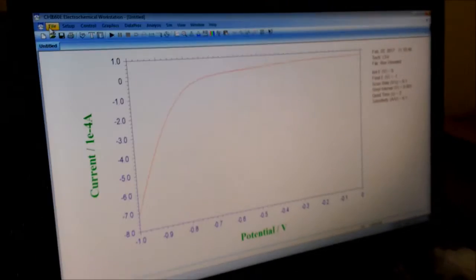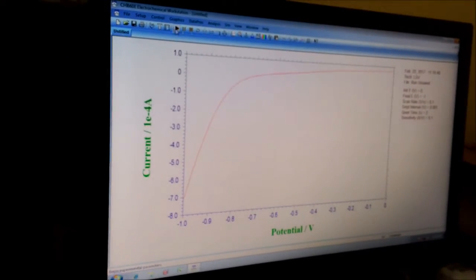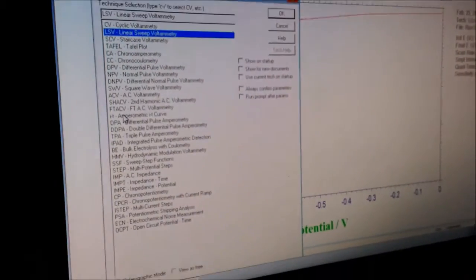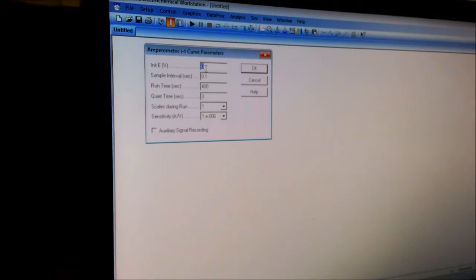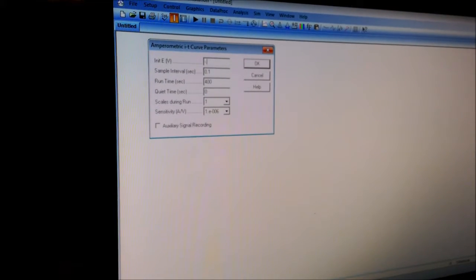So what I have to do next is go to the Techniques section, then select IT — the amperometric IT curve. And I am choosing the initial voltage as minus 0.7 volts.